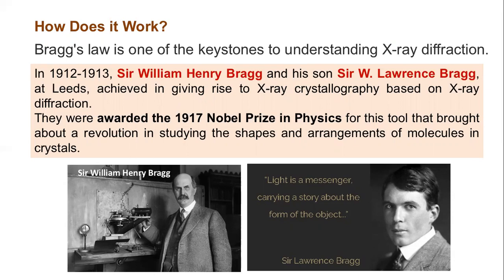And this tool has revolutionized the study of the shape and arrangement of molecules within a crystal. This technique has helped us bridge the gap between physics, chemistry, and biology, and has helped us solve the three-dimensional structure of complex life molecules like proteins, vitamins, and nucleic acids.